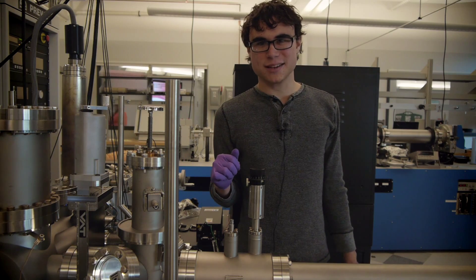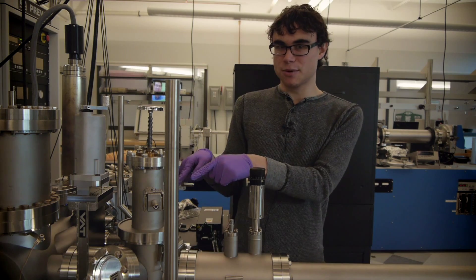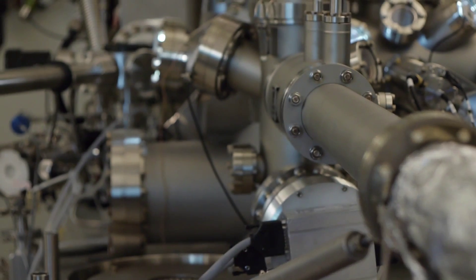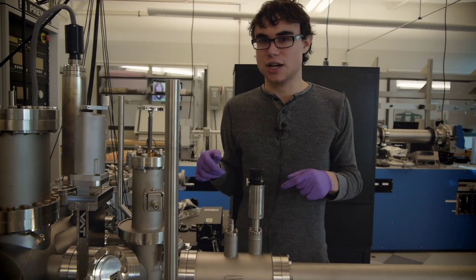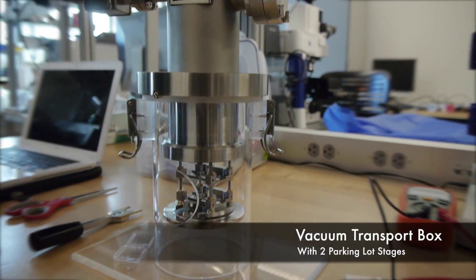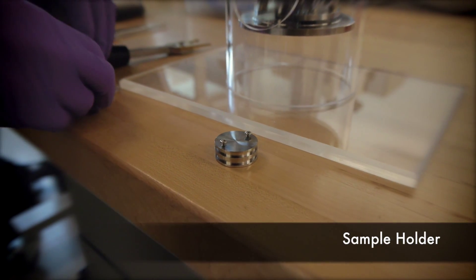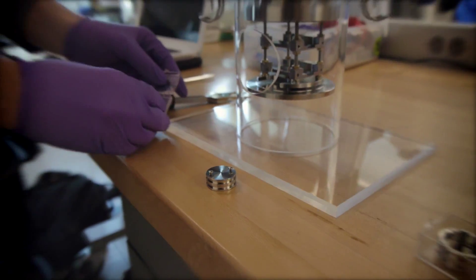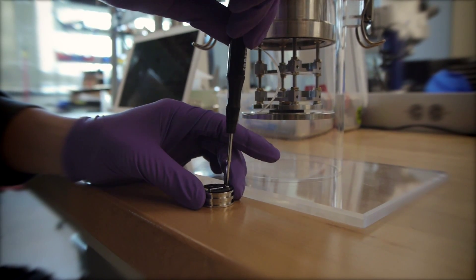Hi, my name is Ross. I'm an undergraduate student, and I'm going to show you how to load the sample. Over here we have the chamber where the sample is loaded, and right next to it we have the transfer arm, which is used to move the sample from this chamber to the rest of the chambers. Here's the puck where the sample is loaded, and right now I'm attaching the sample to this puck.